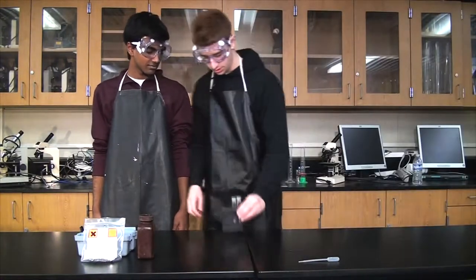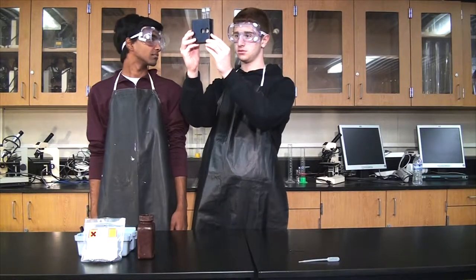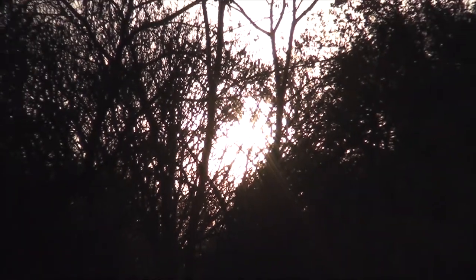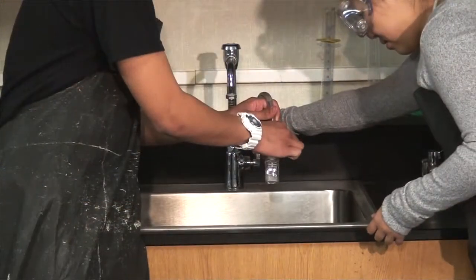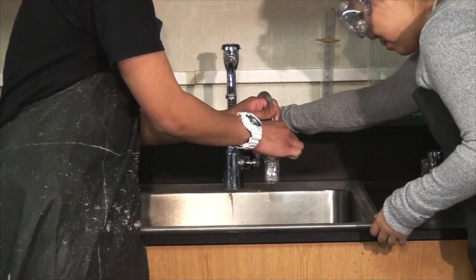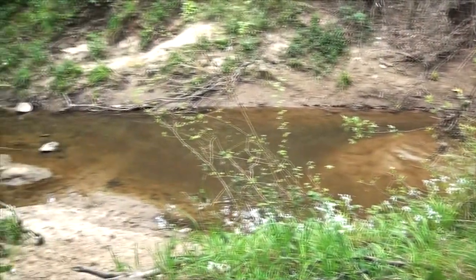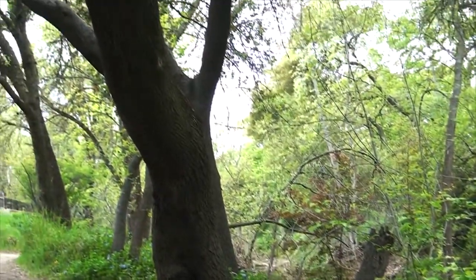Remember to run QAQC by having another member of your field team check your results. This is just a brief look into the activities of the chemistry study. Along with dissolved oxygen and nitrates, this study performs five other tests that include phosphates, hardness, chlorine, ammonia, and alkalinity. Safety is of the utmost importance when performing these tests. The chemistry study is one of the teams that make up the Arcade Creek project, which works towards monitoring the health of Arcade Creek and restoring its natural habitat.